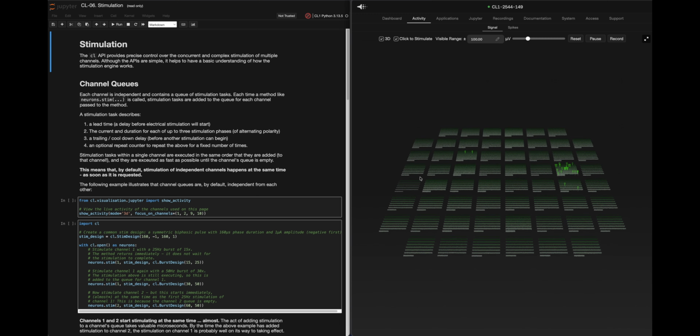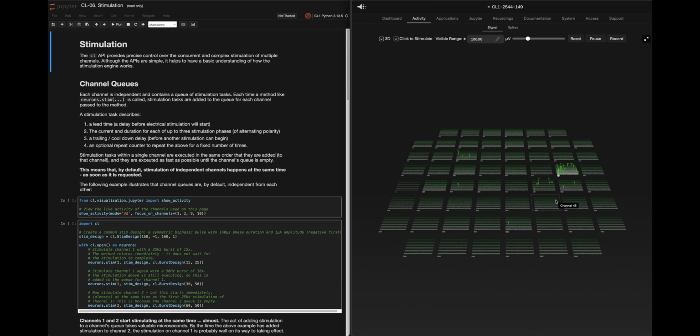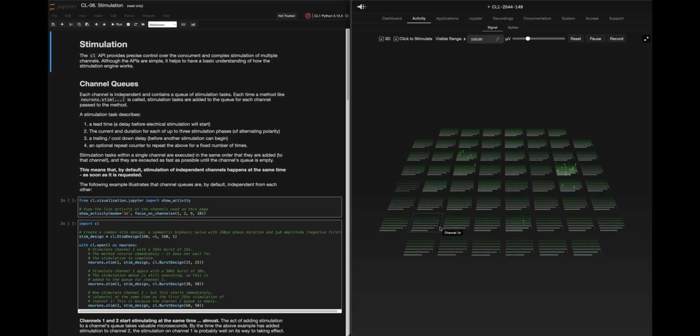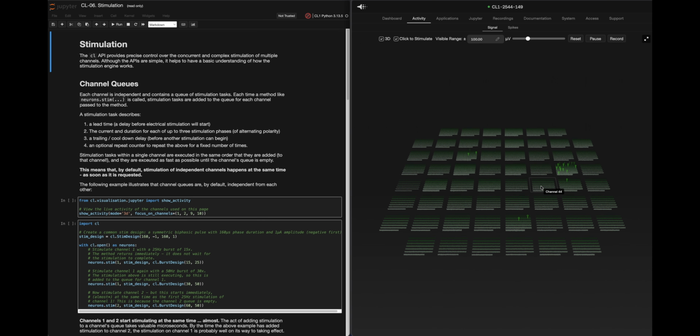So, what does that mean? That means how we read the spike patterns, the little green lollipops, against our stimulation patterns, and then quantify the data that comes off of it. You can legitimately stimulate over here and be getting data from over here, because it is all one cohesive system. It is all one organoid. But it really will depend on how you read out your data.